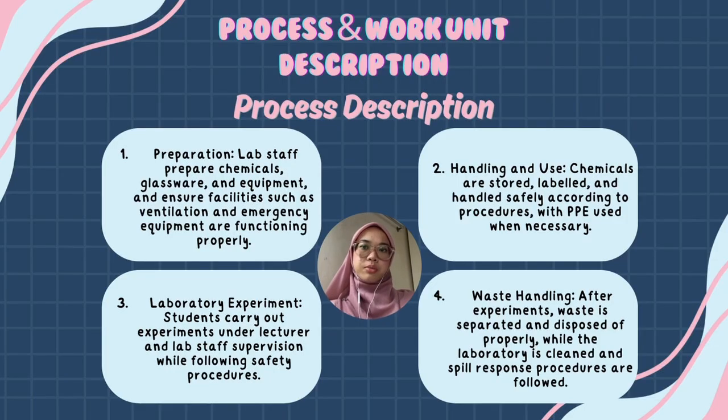Students carry out the experiment under the supervision of the lecturer and lab assistant. Throughout the experiment, everyone must follow the laboratory safety rules and use the chemicals according to the correct procedures. The final step is waste handling and housekeeping. After the experiment, all chemical waste is separated and disposed of according to the laboratory procedures. The work area is cleaned and any chemical spills must be handled using the correct spill response procedures. This helps keep the laboratory safe and prevents chemical contamination. Overall, following these four steps helps ensure that chemicals are handled safely and reduces the risk of accidents and health hazards in the laboratory.